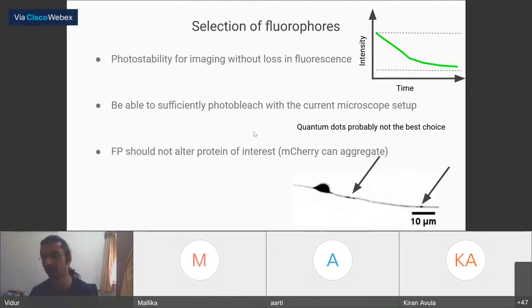As an example, there are newer fluorophores based on, what's it called? You have tandemization of fluorophores where you can have 7, 8 fluorophores to have a super signal GFP. If your protein of interest itself is just 20 kilodalton, you can't have 60 kilodalton worth of 6 and 7 GFPs stacked to it. Because then when you do FRAP, you're not assessing the protein's kinetics, you're essentially assessing the 6x GFP tagged protein's kinetics. So that's something that one has to keep in mind.